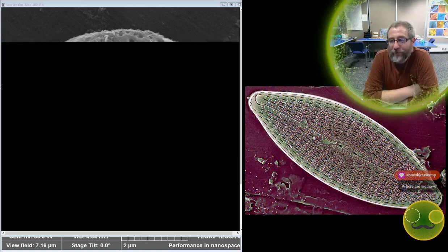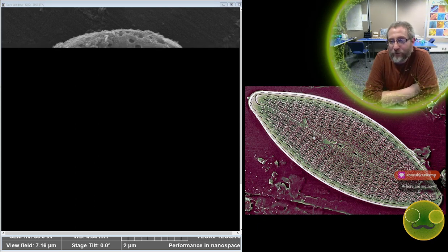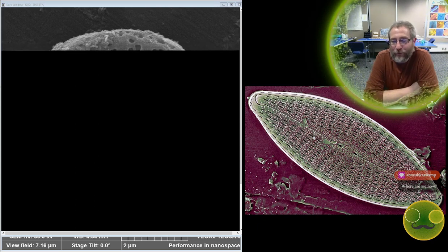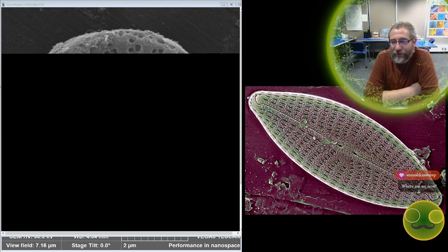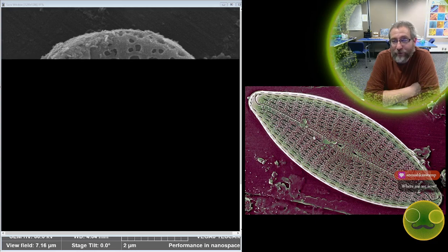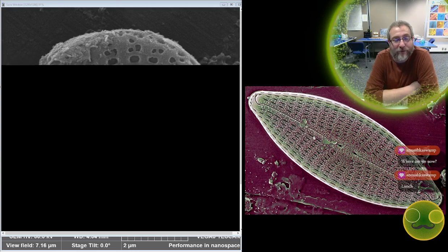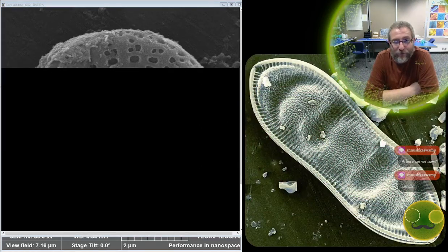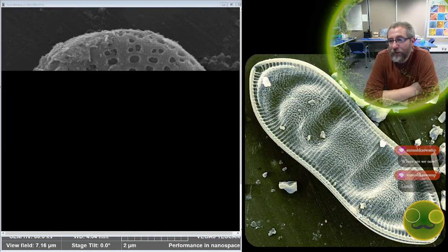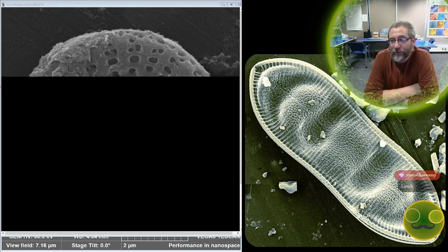Where are we now? Anna, where have you been? We are now in Lake Idaho. We're looking at 10 million year old diatoms from ancient lakes that no longer exist from the Rocky Mountains. You went to lunch. Oh, that makes sense. I ate lunch today before we started. You get caught up. You're glad you caught part of the stream. Good. I'm glad you could hang out for a bit.